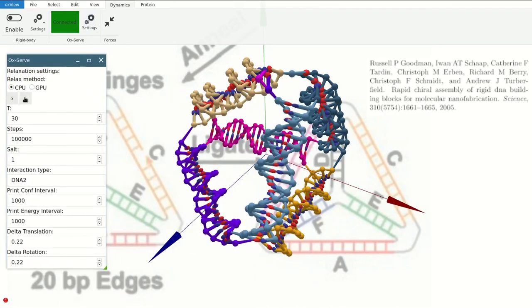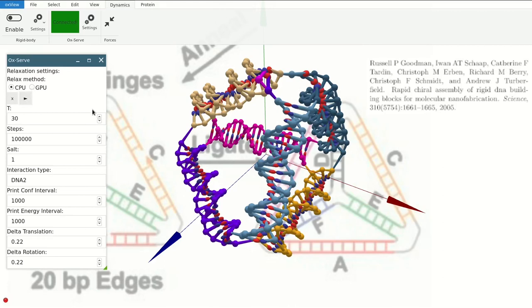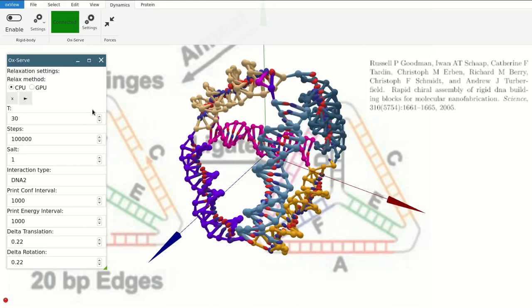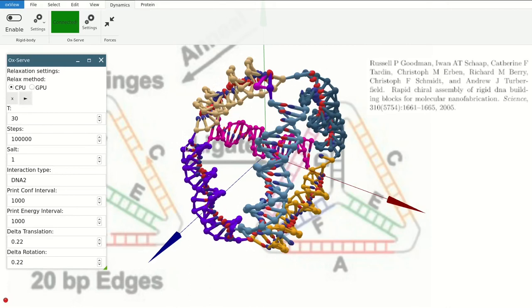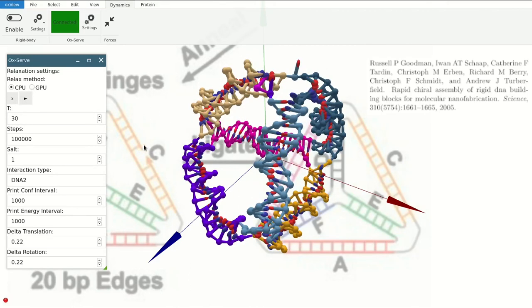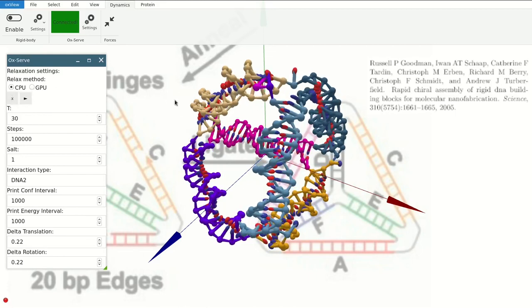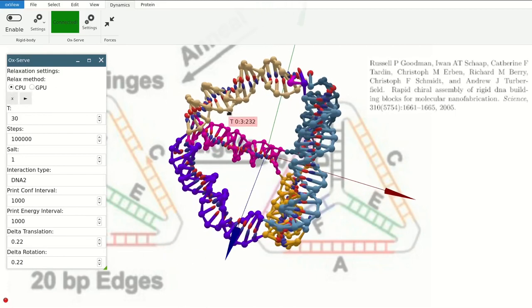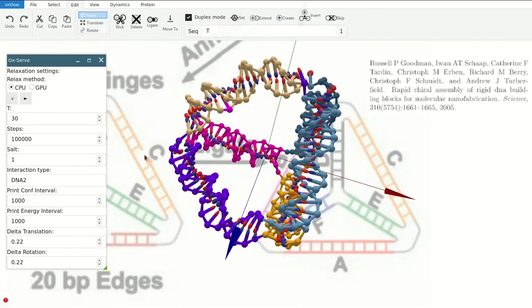Then I can just start the dynamics and see how they move over time. So now everything is relaxed together a bit. If I realize I want to add these hinges here, or not the hinges but have a nick there, I can add a nick to see how it moves with the nick there and just continue simulating.